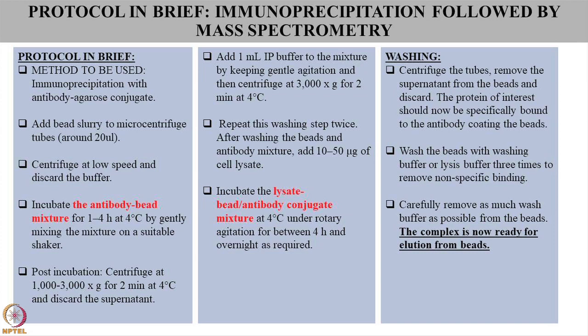But at any point you must remember that for this to be successful, you should not disrupt the interaction. So in all your steps, you need to be very gentle. You should not use something like a very harsh chemical like urea or anything that can denature your protein or even disrupt your interaction. So that's something that you should keep in mind.